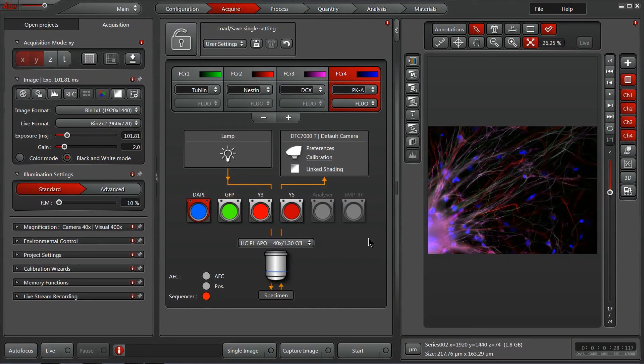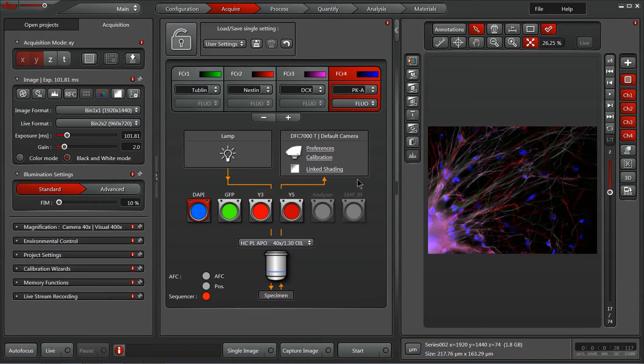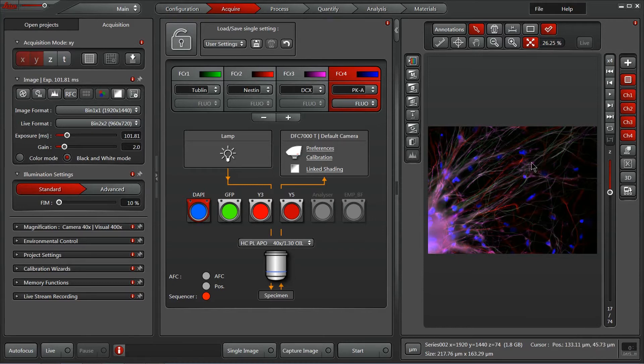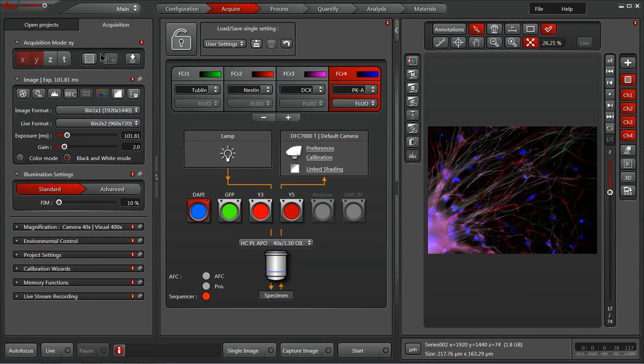Now let's take a deeper look at the Acquire tab here within the LASX software. Notice that it's broken into three distinct panels. The far left panel, the center panel, and this right image display panel all allow you access to different things very easily within our software.